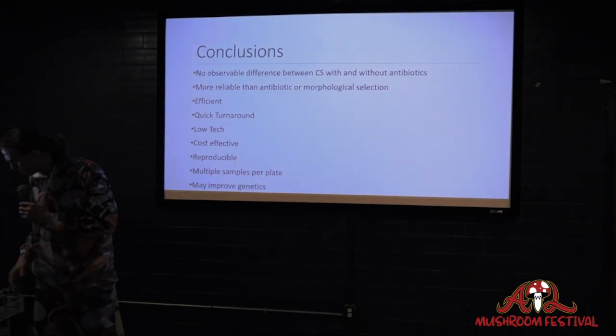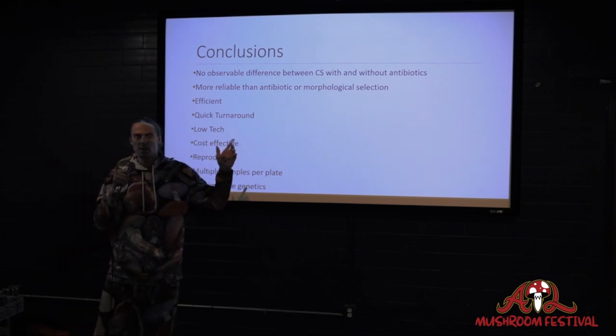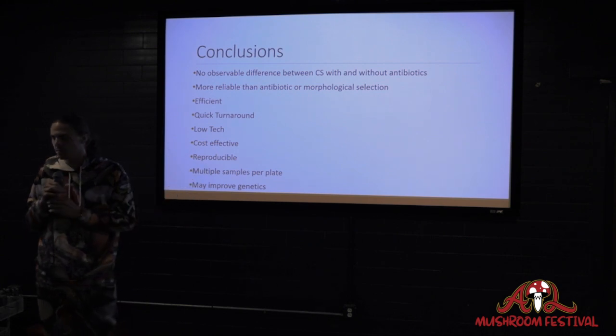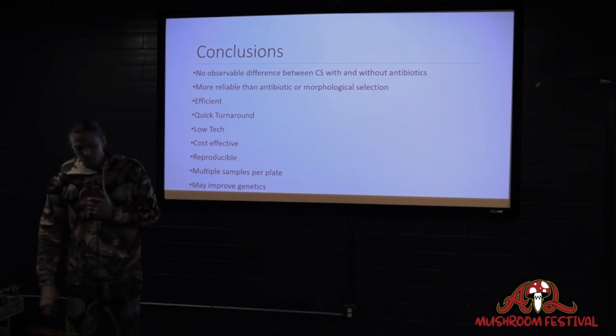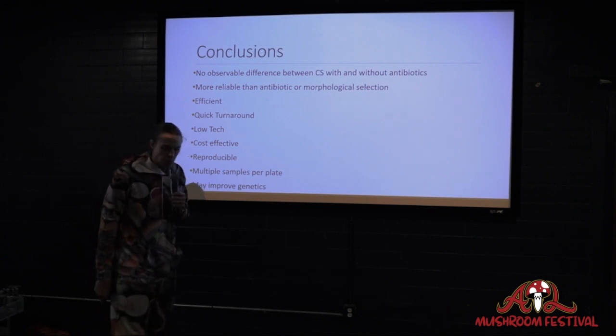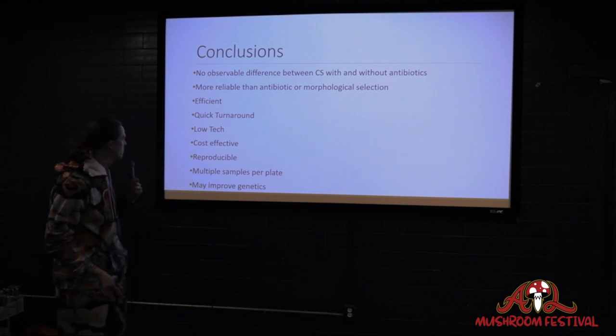So in conclusion, there's no difference between the cabin sequestering technique with antibiotics or without antibiotics. So why use antibiotics? Why waste your money and your time and go through all the loopholes and the rigmarole of having to get a whole bunch of antibiotics and have people questioning why you're getting them and all that other stuff? Why go through that if you don't have to, right?